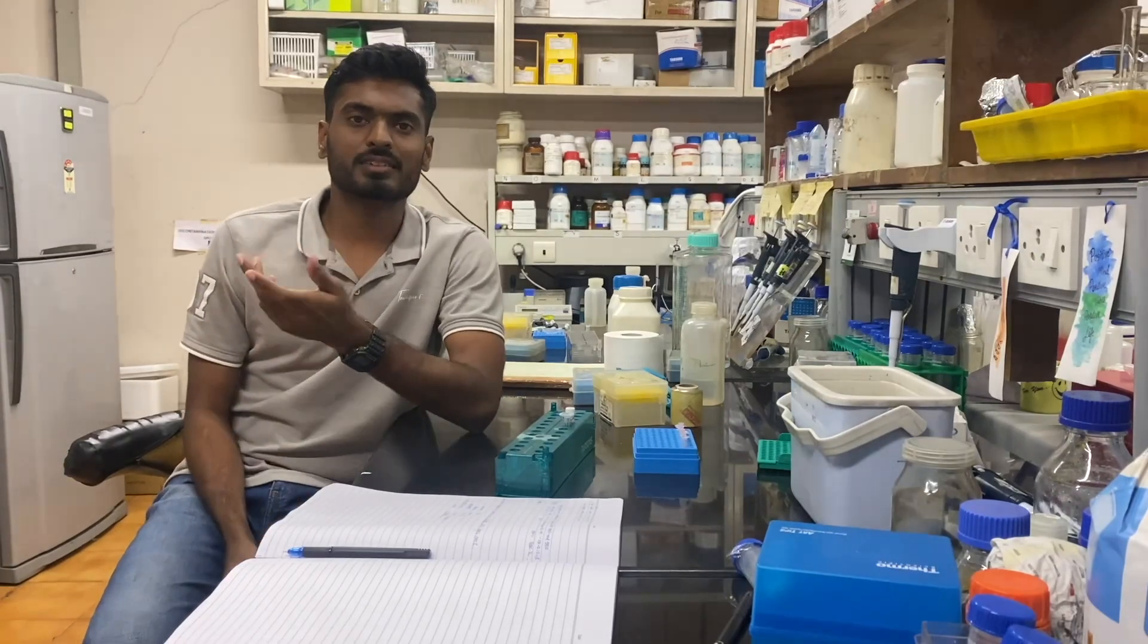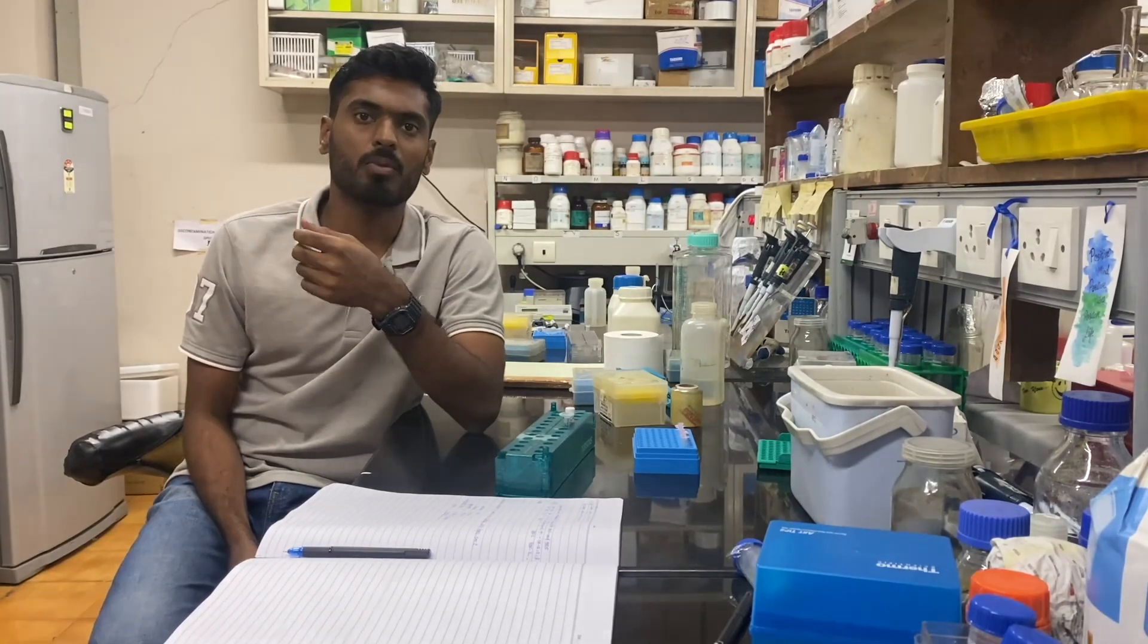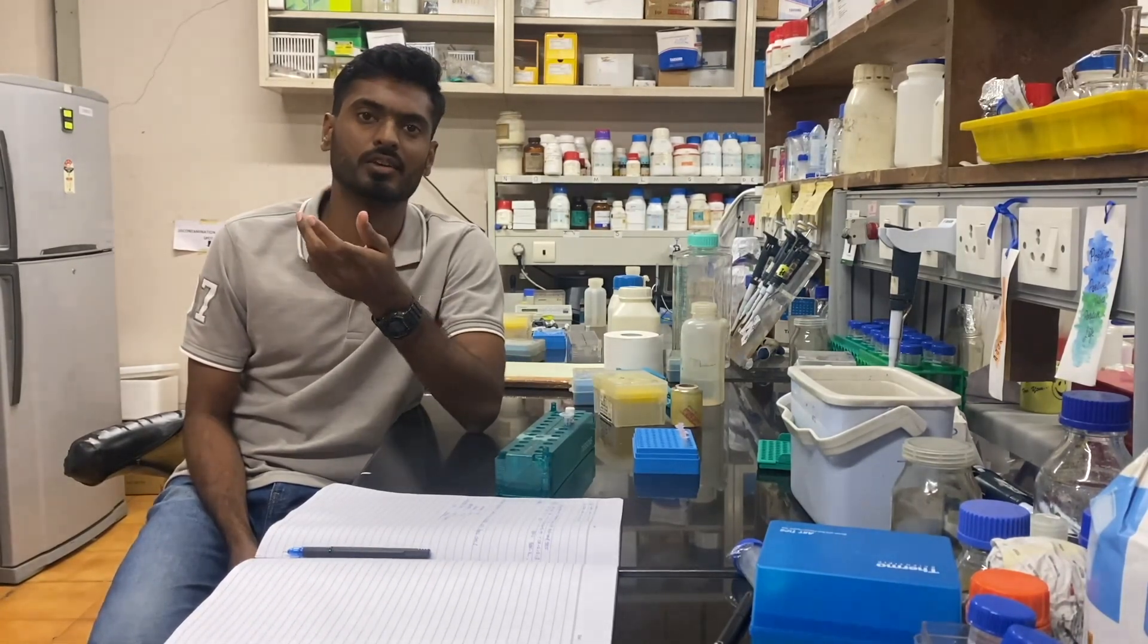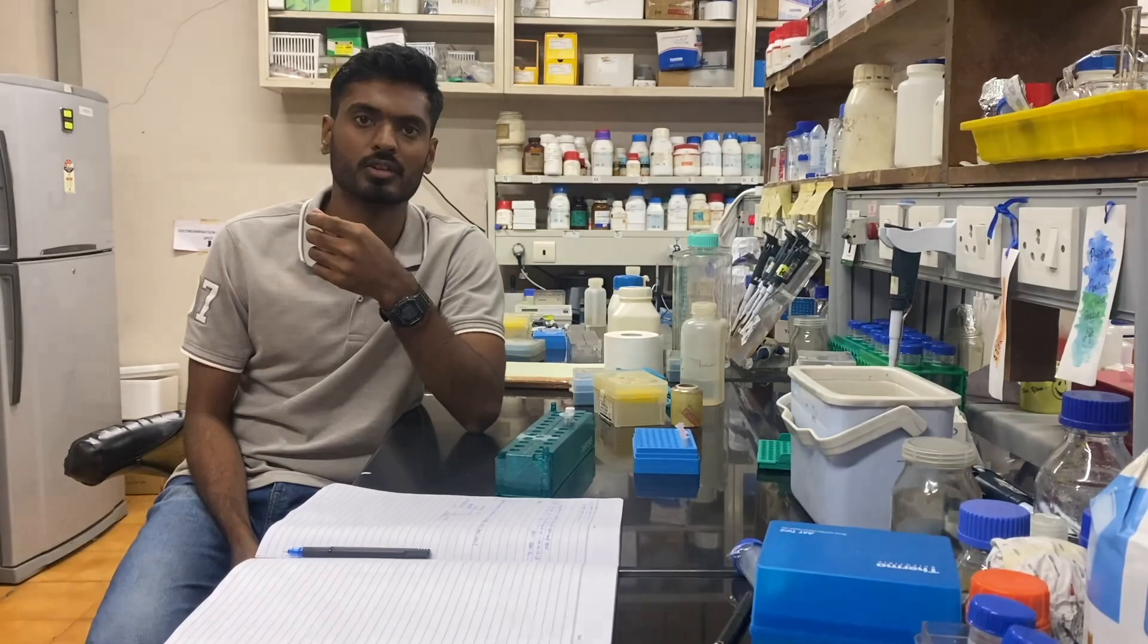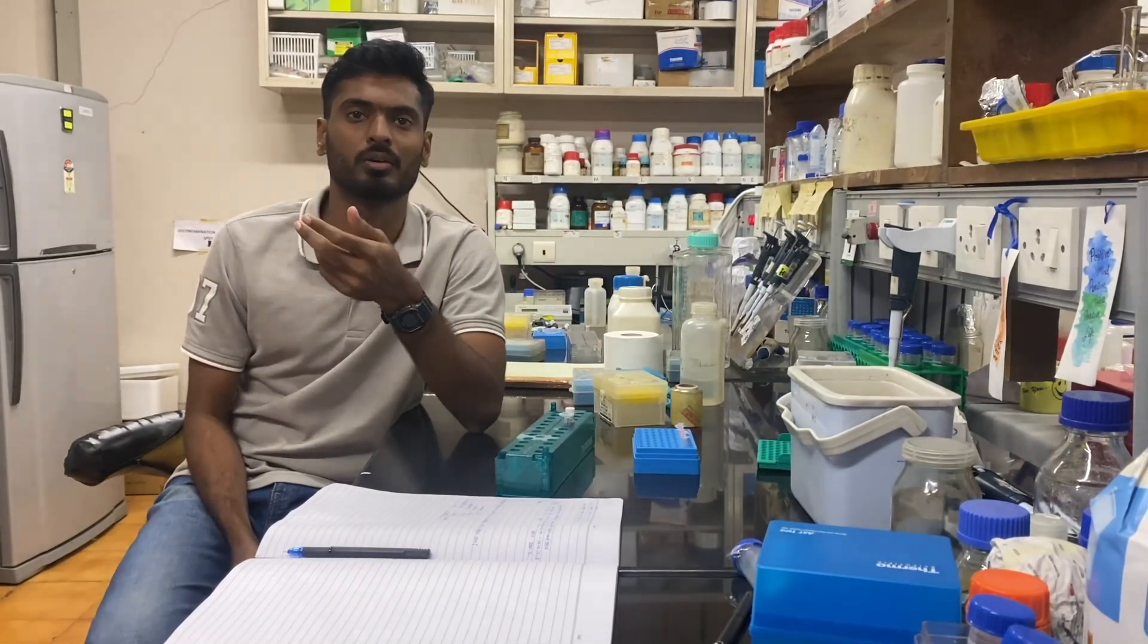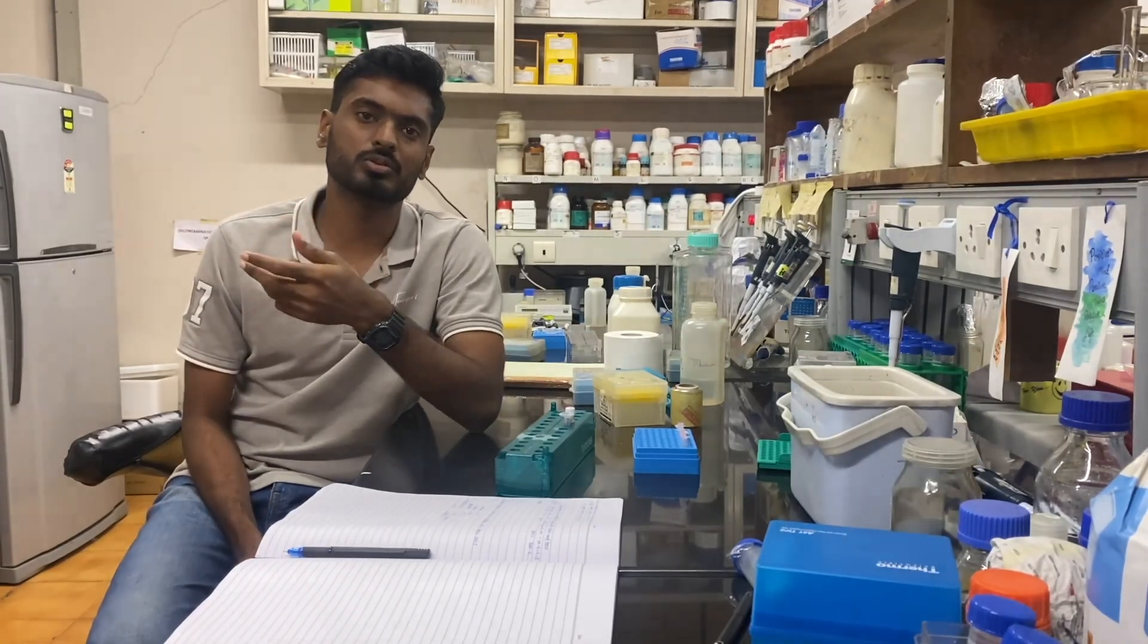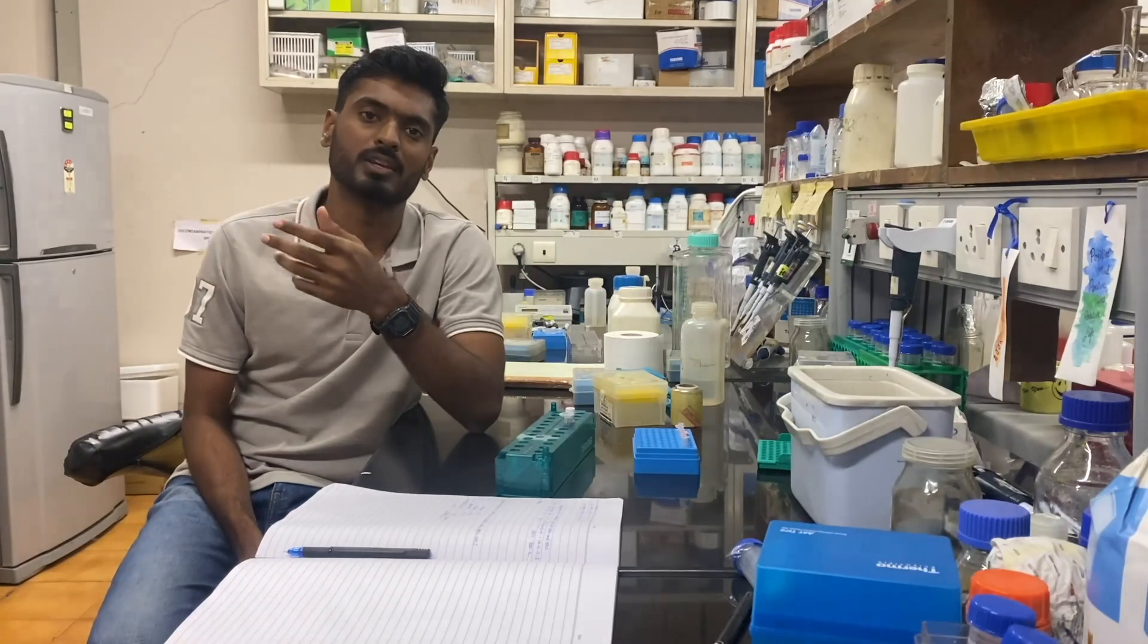Restriction digestion is a process by which the DNA fragment is cleaved by using or by the action of the restriction endonucleases. The restriction endonucleases are the type 2 class of endonucleases which cleave the DNA molecule within or near sites which have specific base sequences.